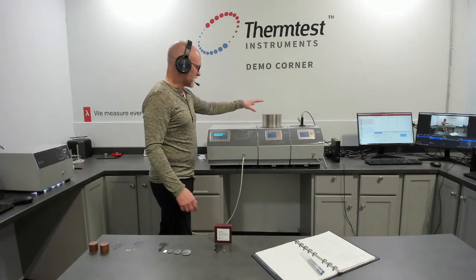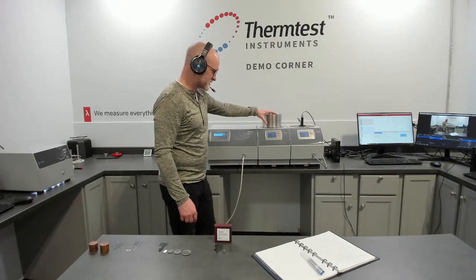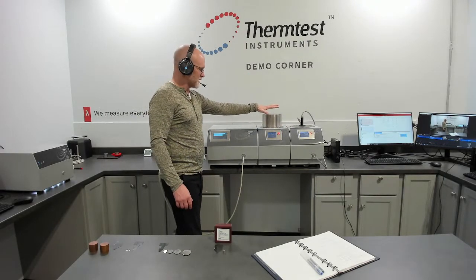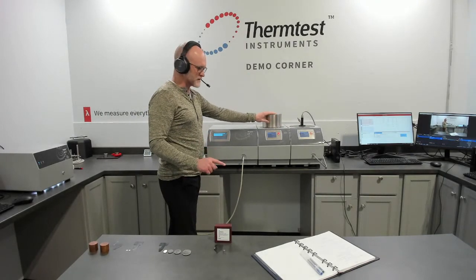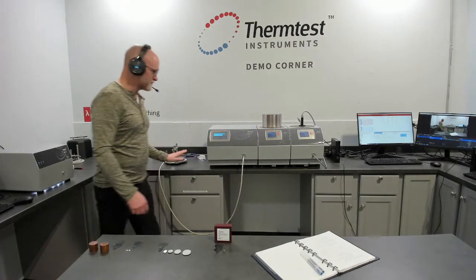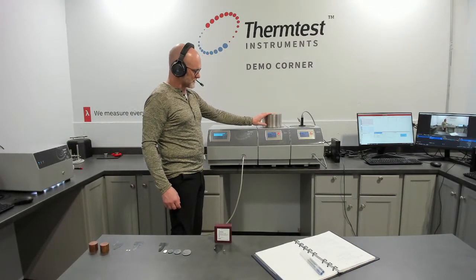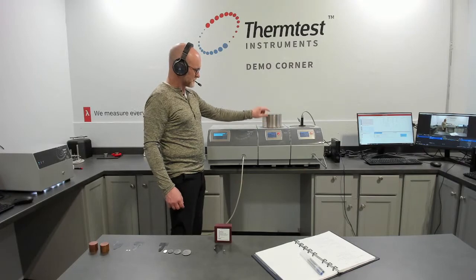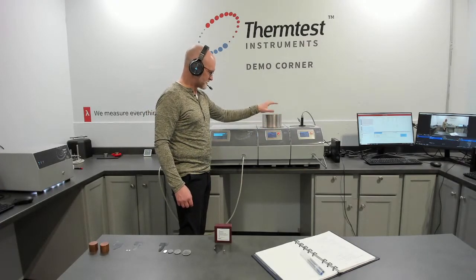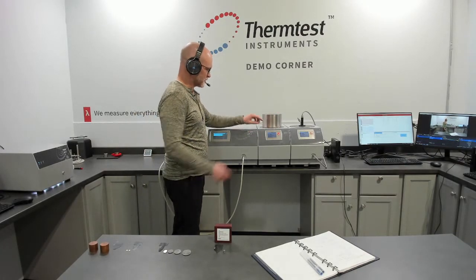Temperature platforms that you can add to each method, again, transient plane source and transient hot wire, and the temperature ranges of these are available on the website. The transient plane source, all the measurements I'm talking about today can be done at room temperature as well as inside of a temperature platform, and we recently did a demonstration on the temperature platform and how it set samples up and the different test cells that are available for it, as well as the temperature range that is available and the options on it.